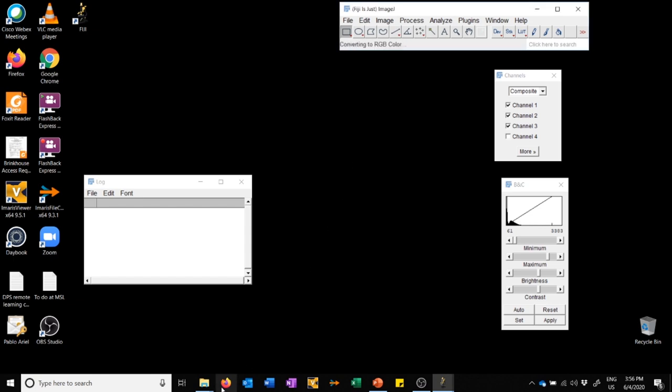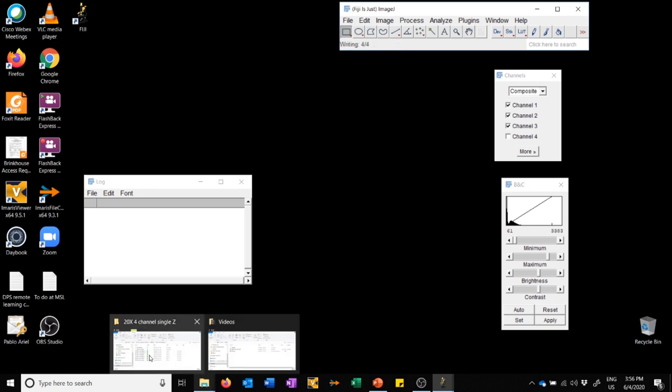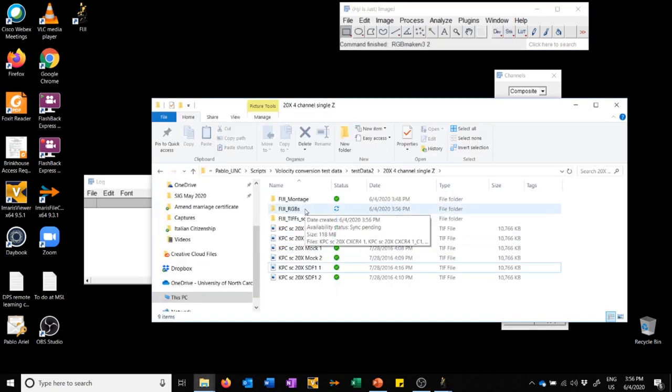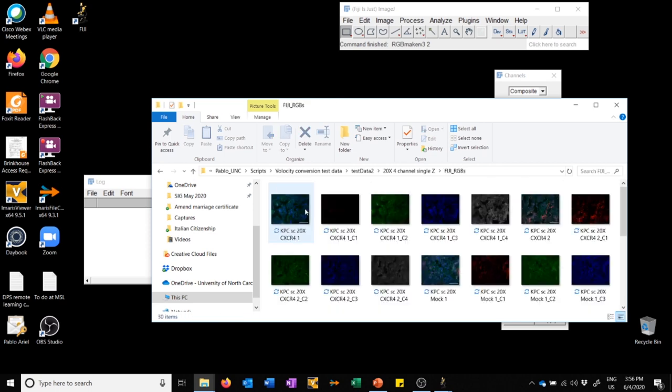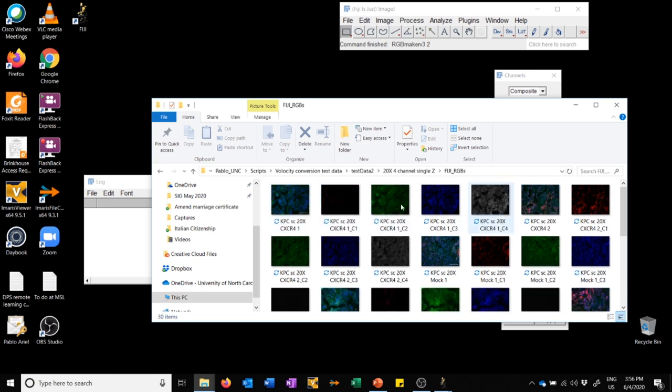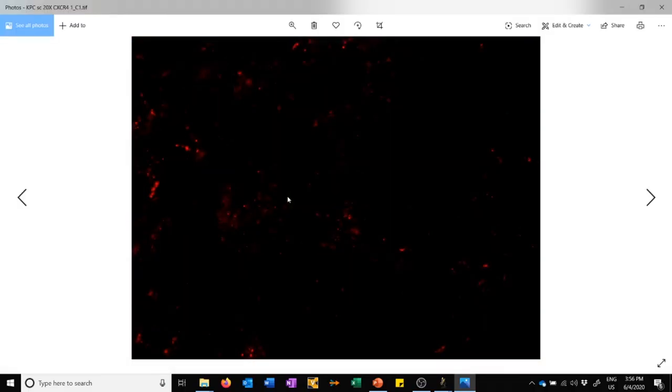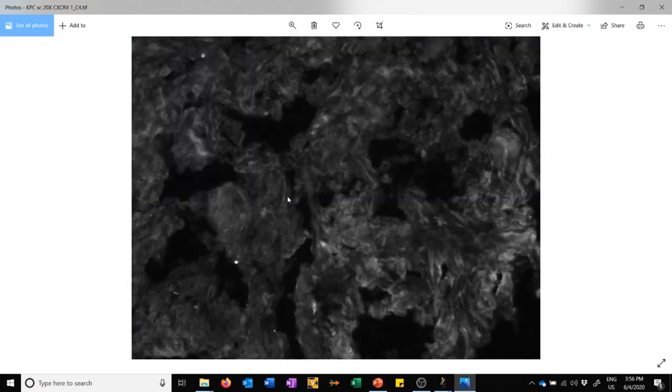So what it's doing now, if we go to the folder, it made a new subfolder called Fiji RGBs. In this subfolder, we now have a composite image for each one and the single channel images for each one. These have all been displayed with the settings that we made and that we tweaked in the montage image, and they've all been tweaked the same.